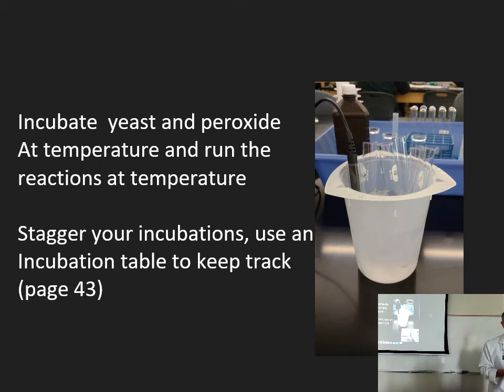So what you're going to do is think about your design, because the way I envision this, you're going to cool and heat yeast and peroxide. One way that students mess this up: they go, oh, I have to cool off this yeast and this peroxide, so I'll mix them together in a test tube and put them in ice. Don't do that. The reaction's done before you even cooled it off or warmed it up, right? I've had that happen in lab, so don't do that.